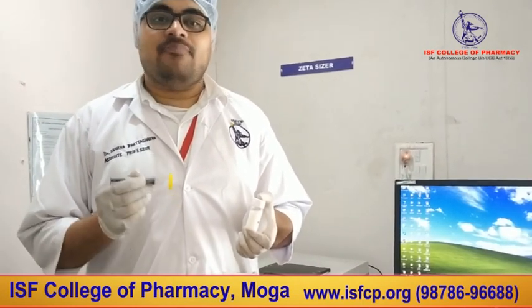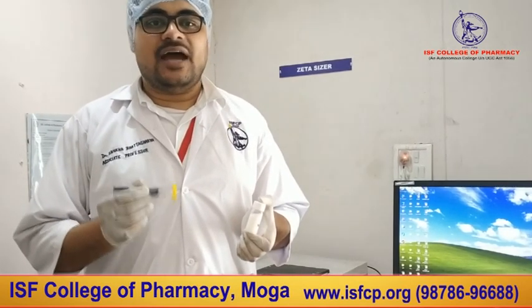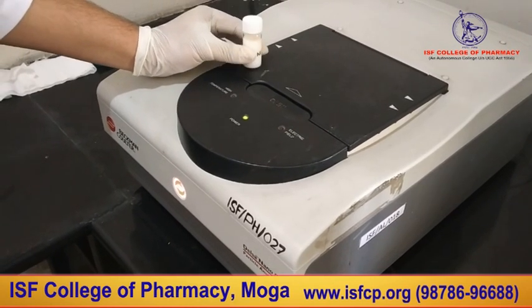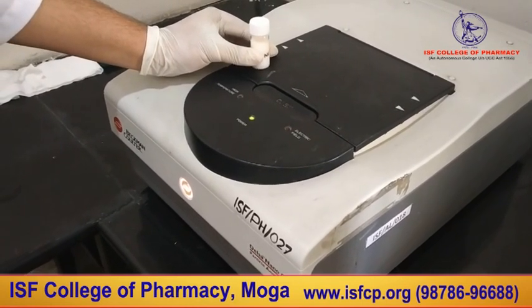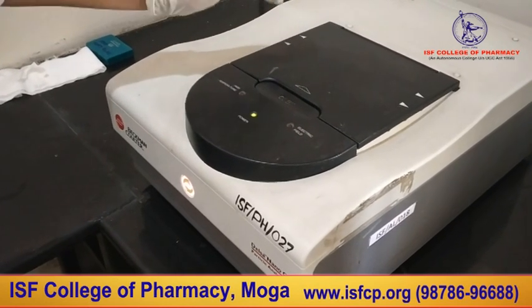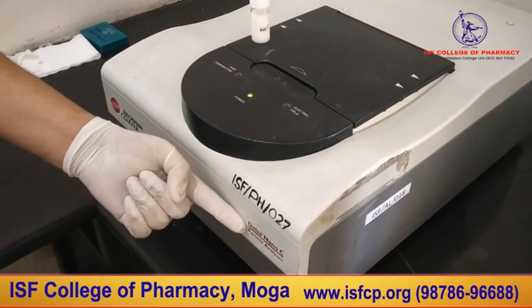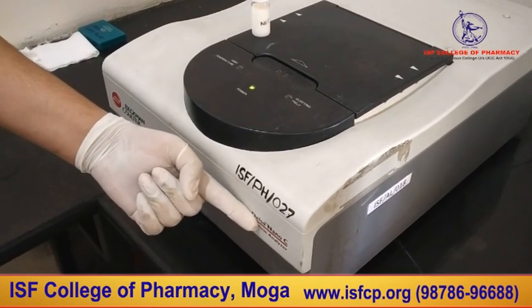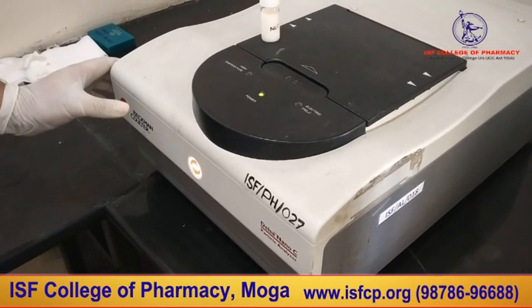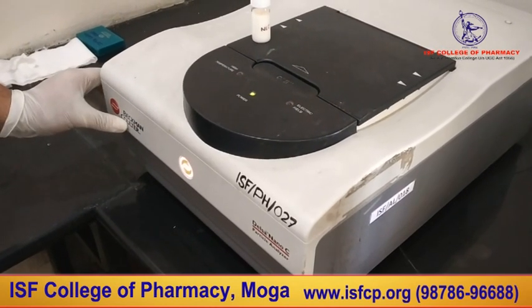The importance of the membrane filter is that it produces the desired particle size. Friends, we will be measuring zeta potential and particle size of our nano formulation utilizing the Delsa Nano C particle size and zeta potential analyzer manufactured by Beckman Coulter, USA.